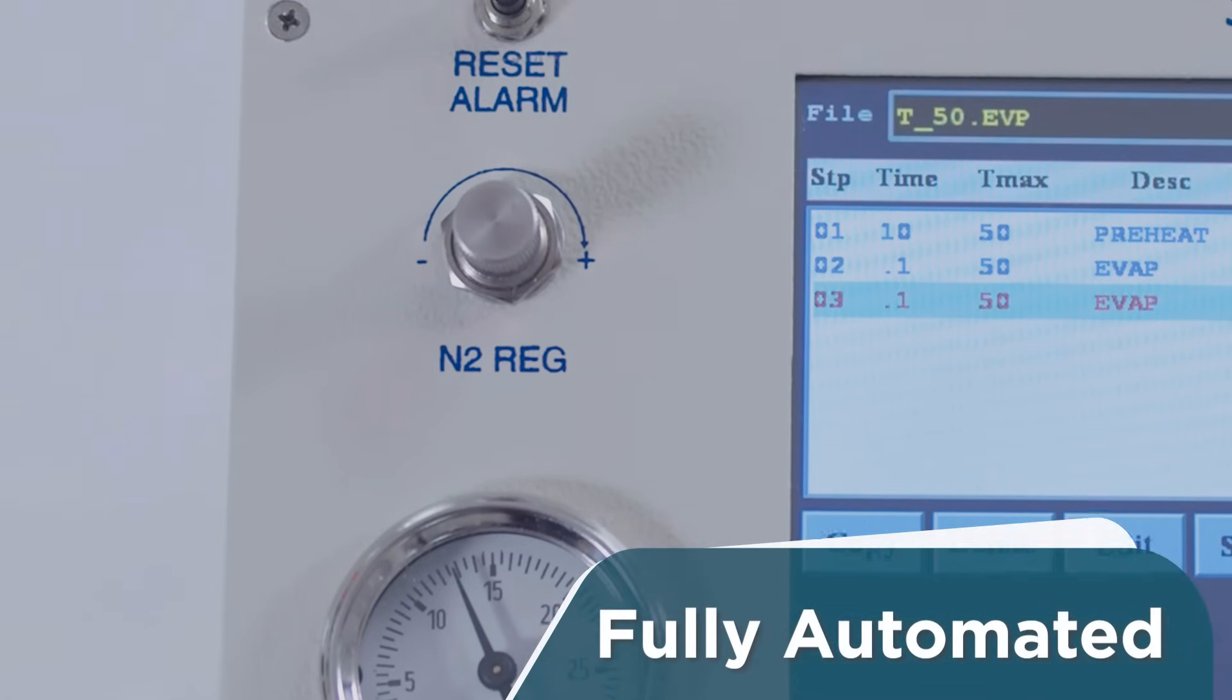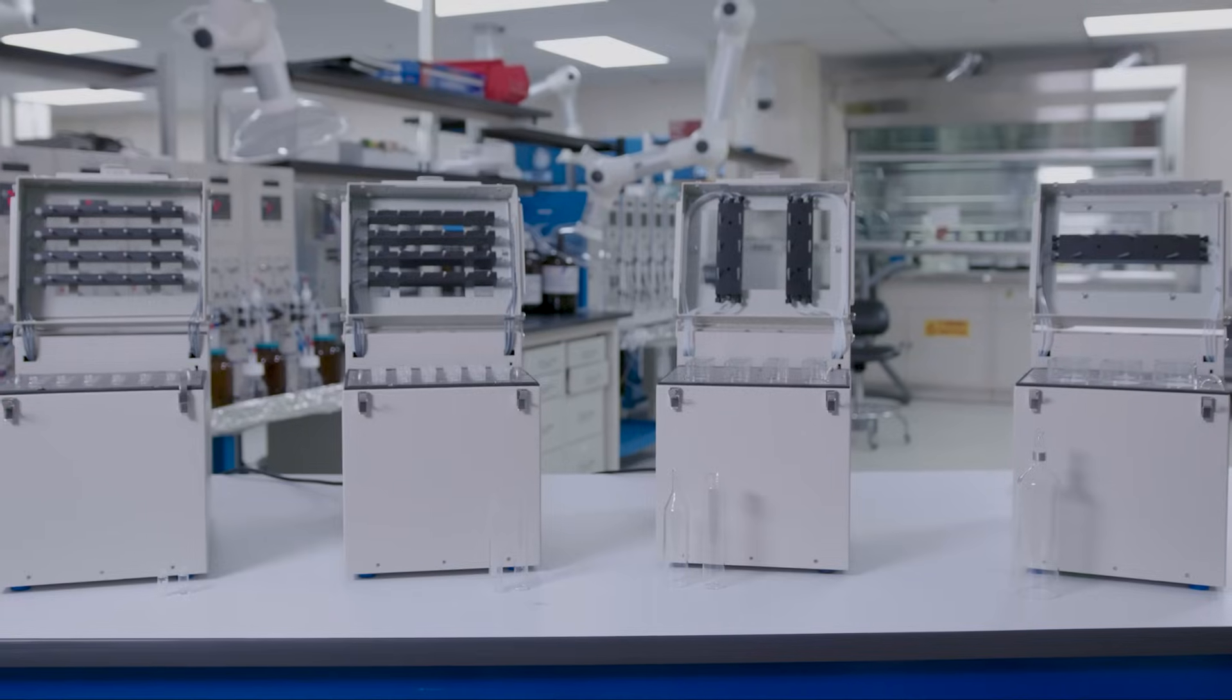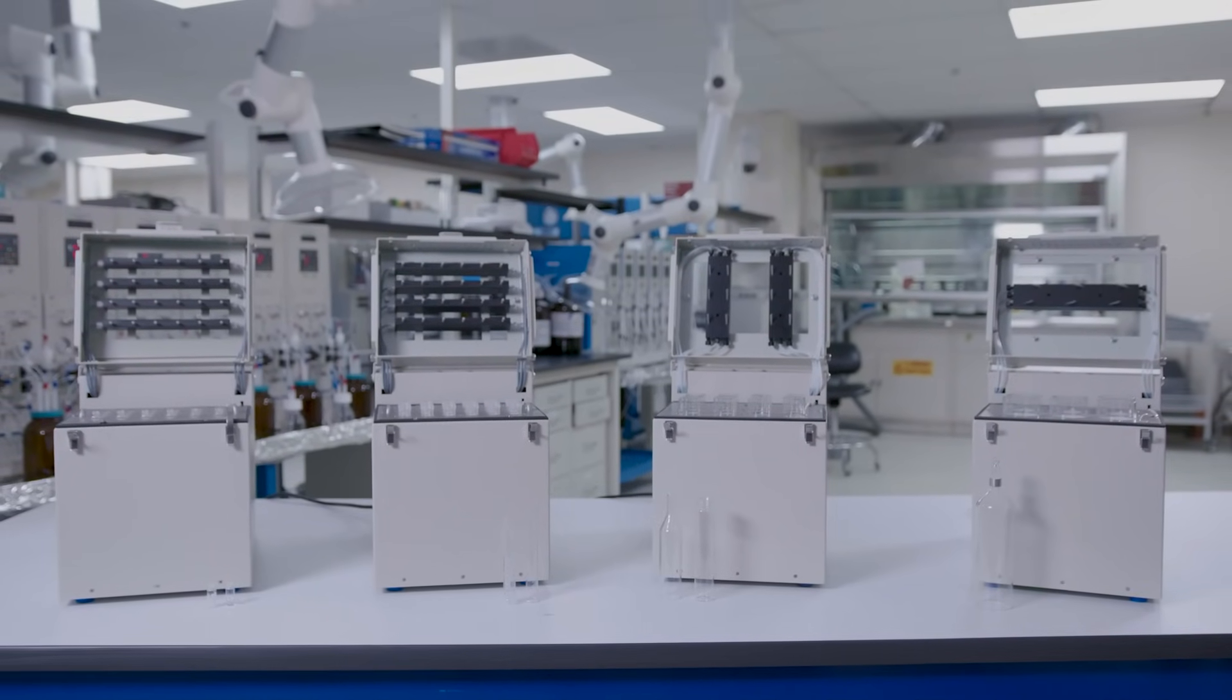Programmable by endpoint sensor or by a designated end time. The SupraVap family of concentrators can meet all of the laboratory's concentration and evaporation needs.